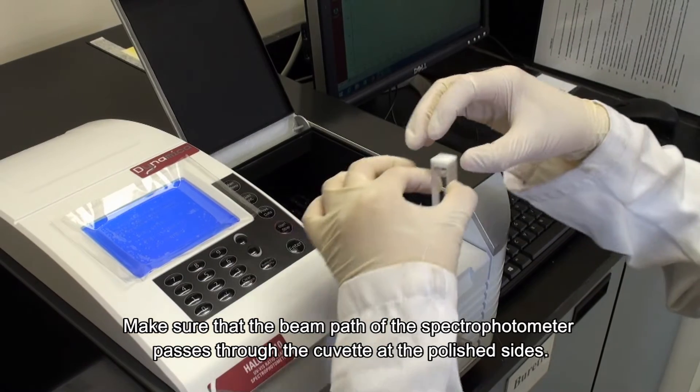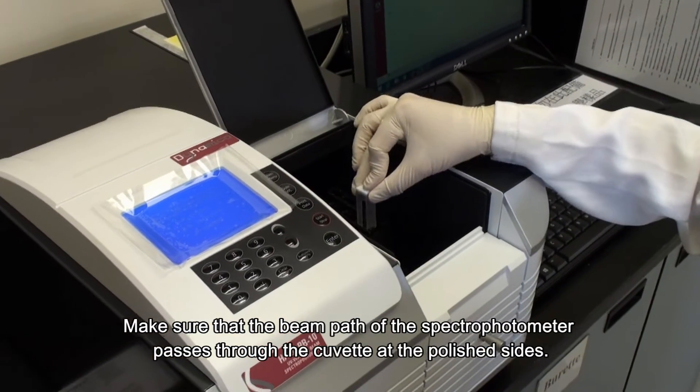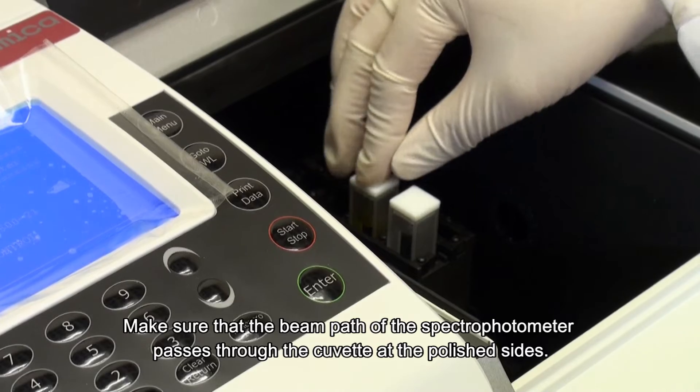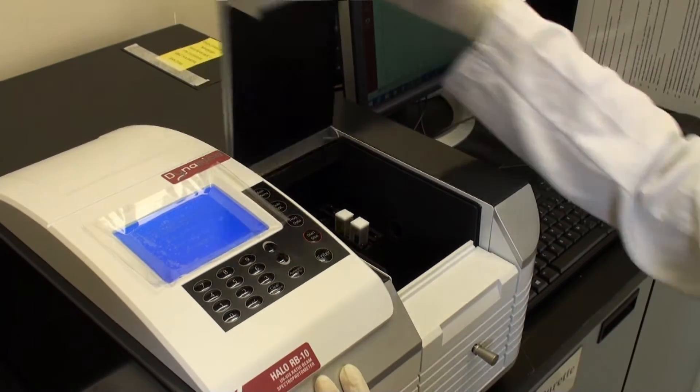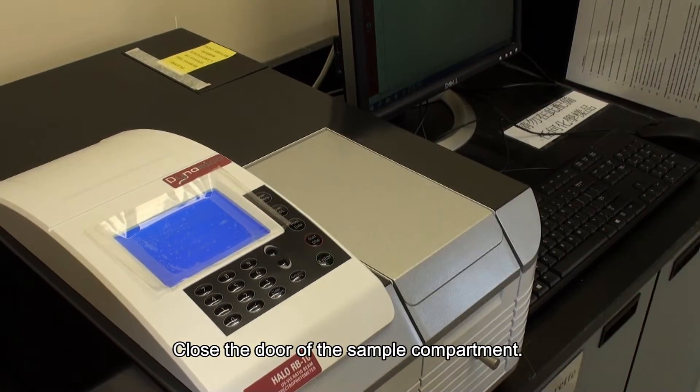Make sure that the beam path of the spectrophotometer passes through the cuvette at the polished sides. Close the door of the sample compartment.